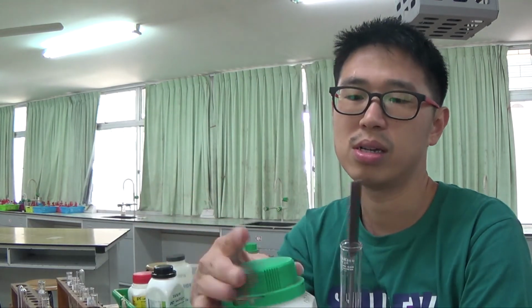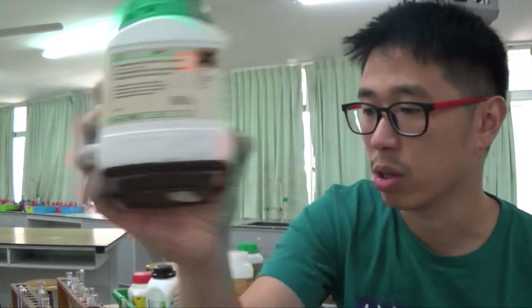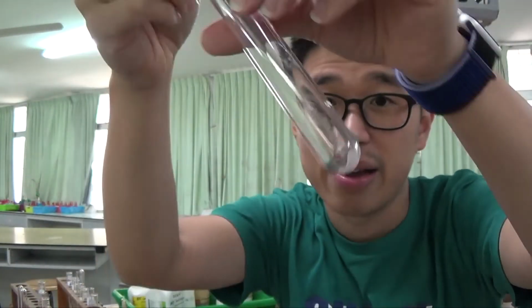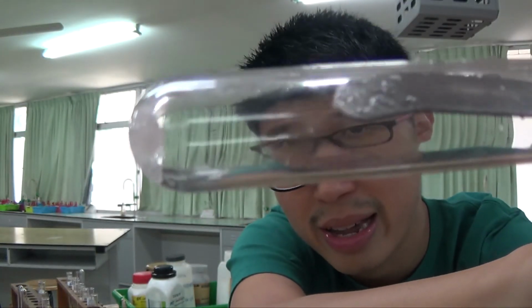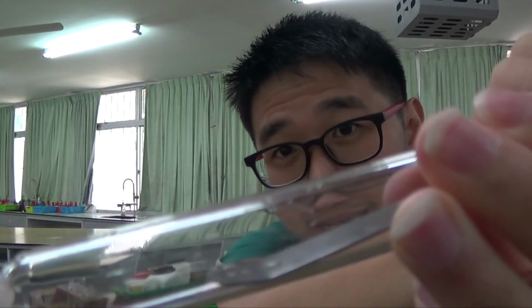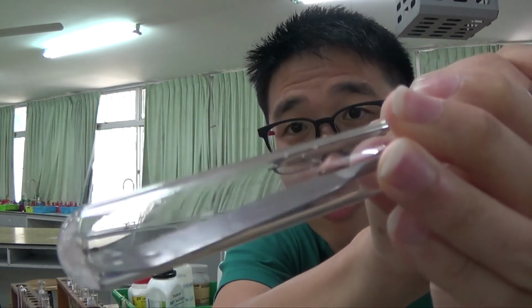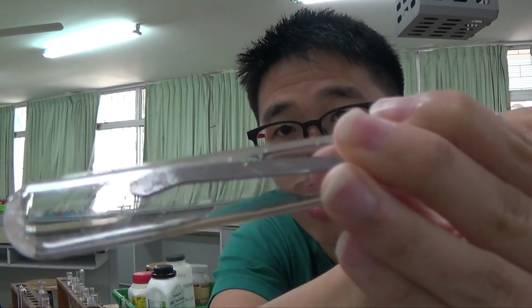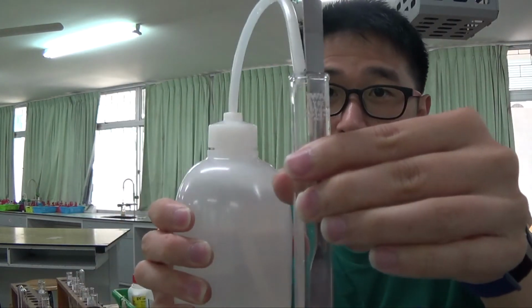So remember, it was a hydrated compound, so it's got water of crystallization. My spatula was dry just now, and you see it looks a bit wet now, and that's because the water of crystallization, I think, has started to come off, and that's why you get a bit of liquid water. Doesn't matter. I'm just going to dissolve it in distilled water anyway.